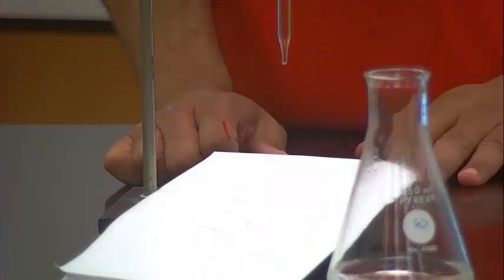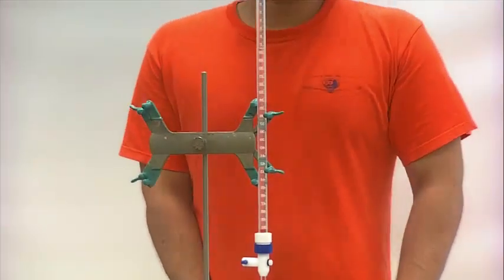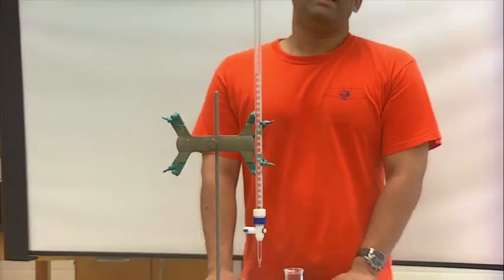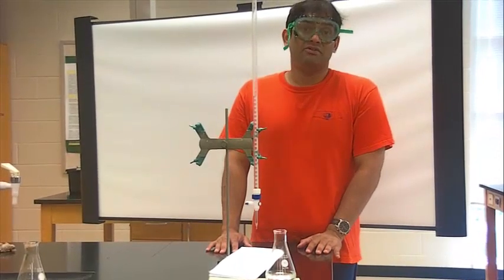I'll quit while I am ahead, and I have my value for my exact titration. I'll note that down to 2 decimal places. And now I have a trial titration and exact titration, 2 values.